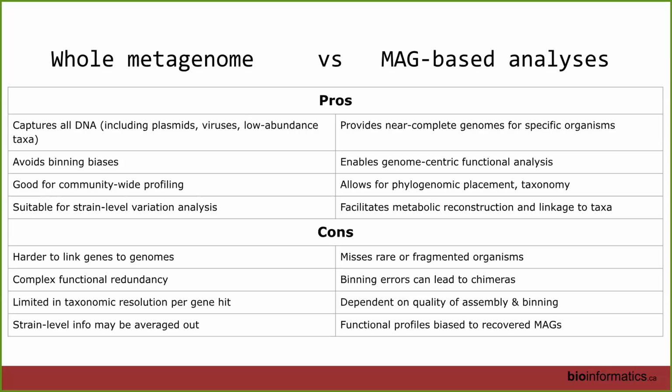I'm not going to read through every single one of these, but it's very important to weigh these options. You can always run an analysis. That's generally fairly painless, but if you put in something that you don't understand, you're going to get something out that you can't understand or that you can't interpret. And so that's very important.